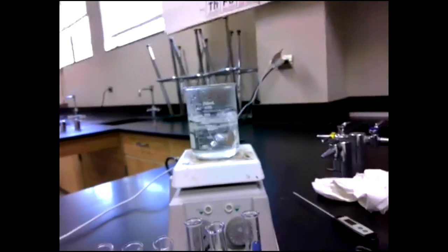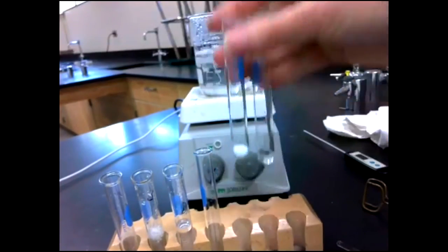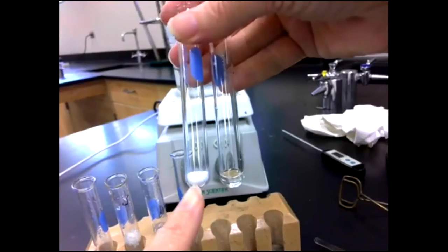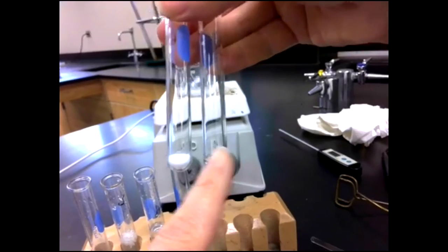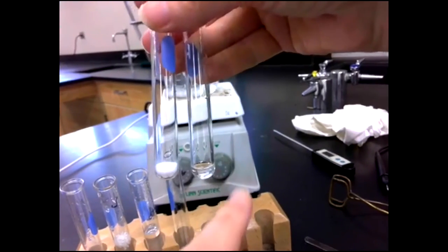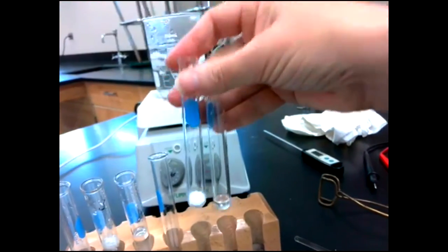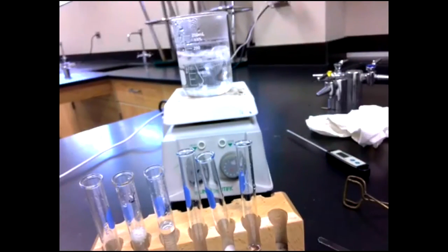So we have a few minutes left. So just to show you these again. So big difference in melting temperature, high melting and low melting. If we wait long enough, I don't think it'll happen while we're here, but this will cool back down and it will look white again. It'll re-solidify, which is kind of cool. Okay, that's it. Got the camera to work.